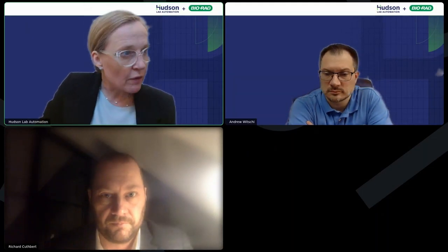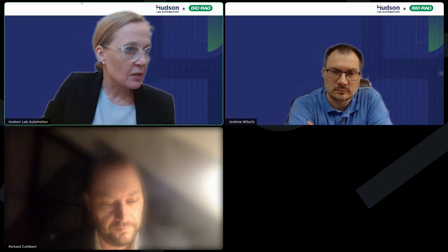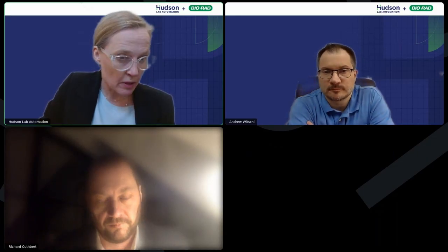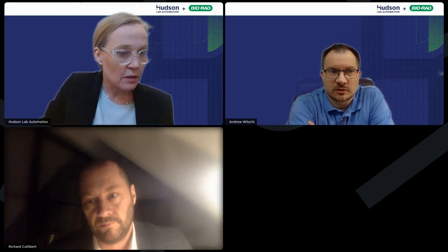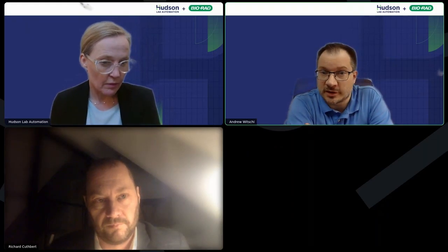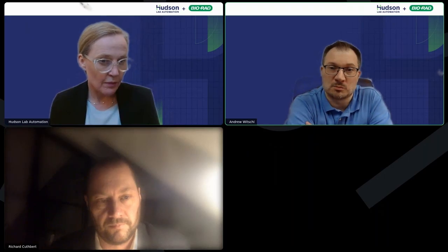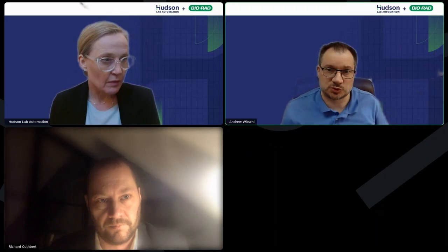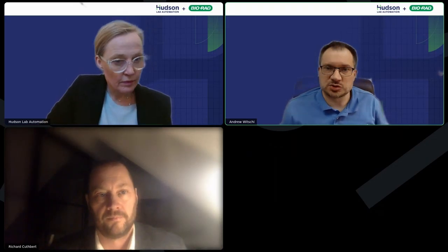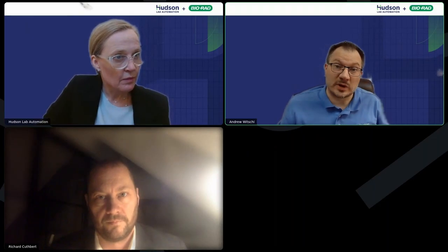Thank you. Next one for Andrew. How long does it typically take to design, install, and commission a system like the workflows shown today, from initial concept to running experiments? Yeah, obviously, if you're looking at getting your foot in the door with some task-based automation, you can get instruments in the scale of days to weeks. If you're talking about moving to the next step, where you're just going to try to load some plates into it, right? You're trying to make more effective use of that instrument. That's usually a pretty close to out-of-the-box project that could be done anywhere from weeks to months.